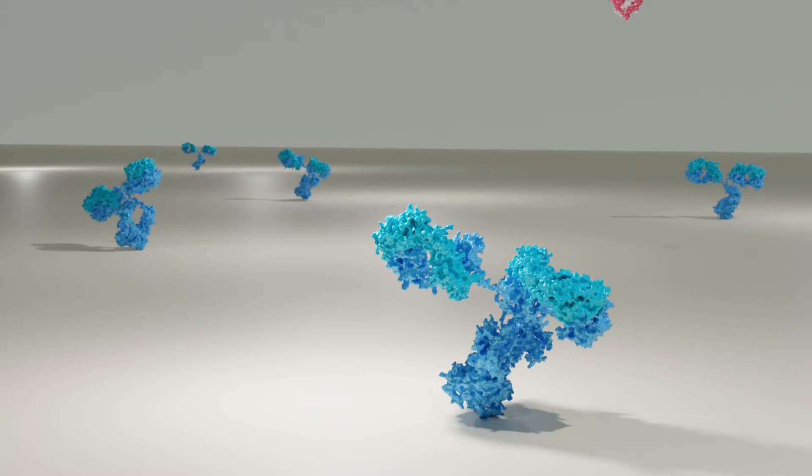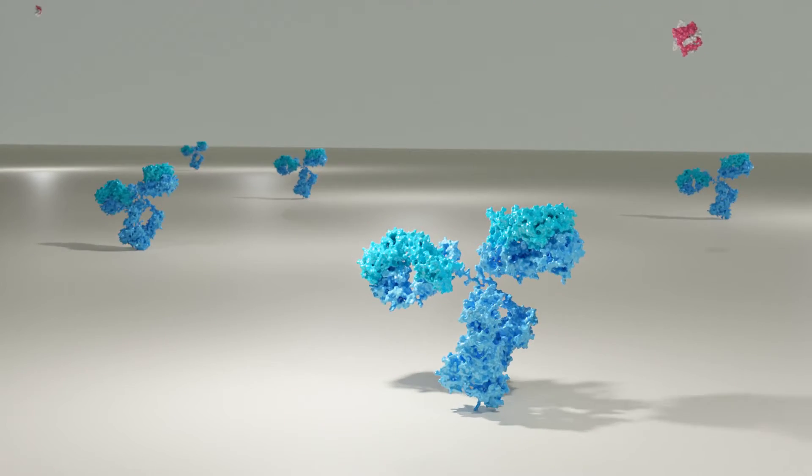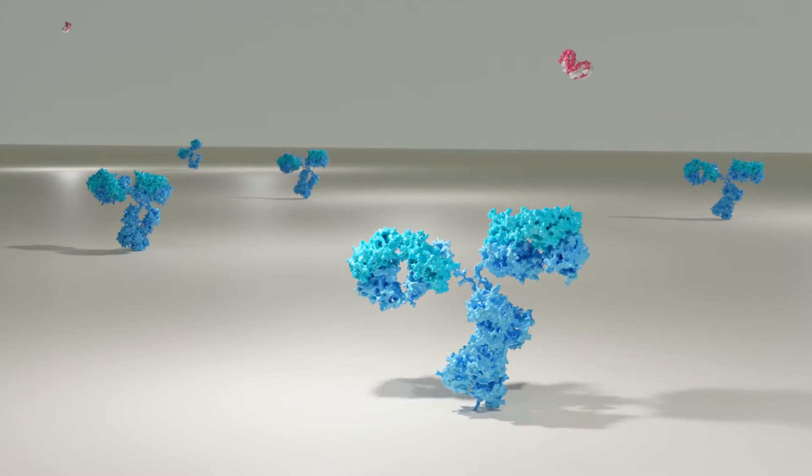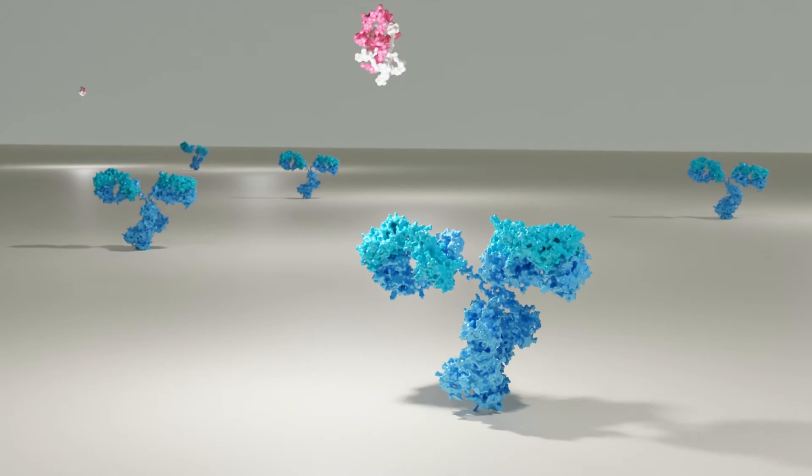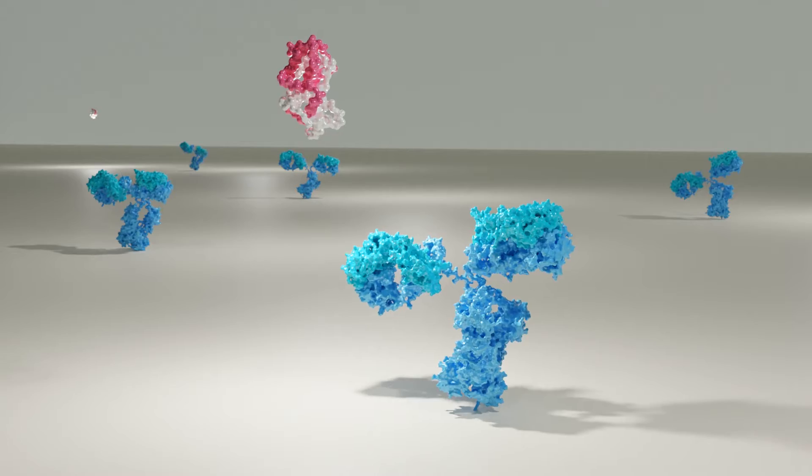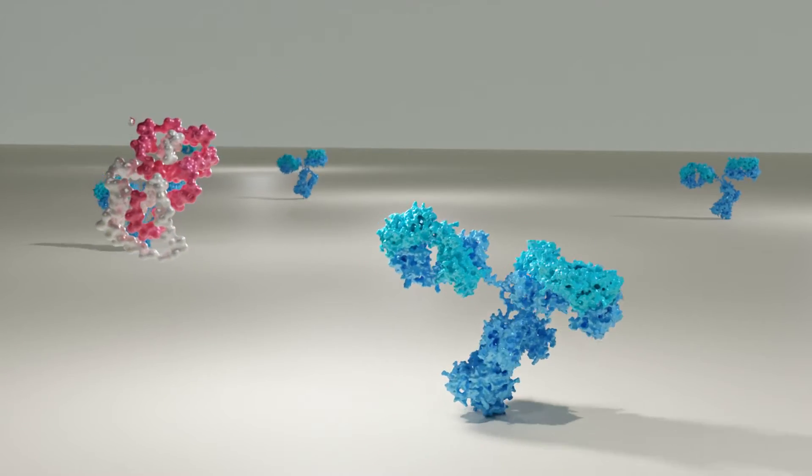In the incubation time, gamma interferon has the opportunity to bind to the specific antibody. Diluting the samples, we know that the antibody is present in excess.